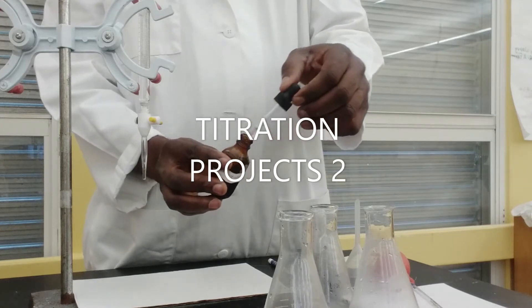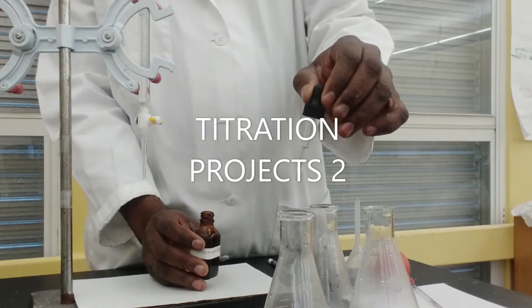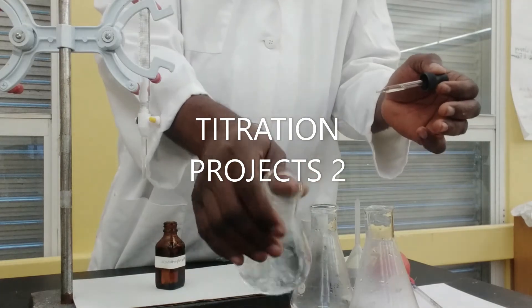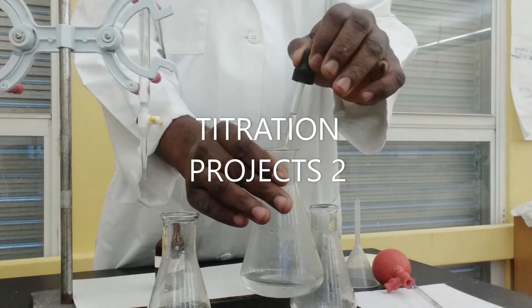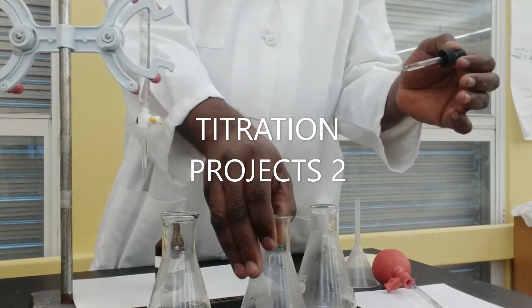In the acid region, the color of phenolphthalein is colorless. So I'm dropping three drops of phenolphthalein into each of my acid solutions, and you'll notice there is a colorless color — there is no color change.